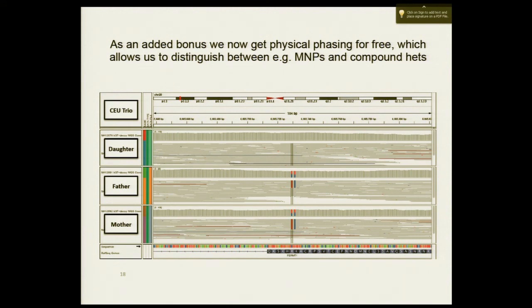You'll see the first SNP has something like 6 reds in a row, and many pipelines would filter that as a homopolymer. They would get rid of that SNP, and you would be left in your VCF file with just this one variant, which is totally different from the reality, right? So by considering these variants in concert, you get a much more holistic picture of what's going on here.